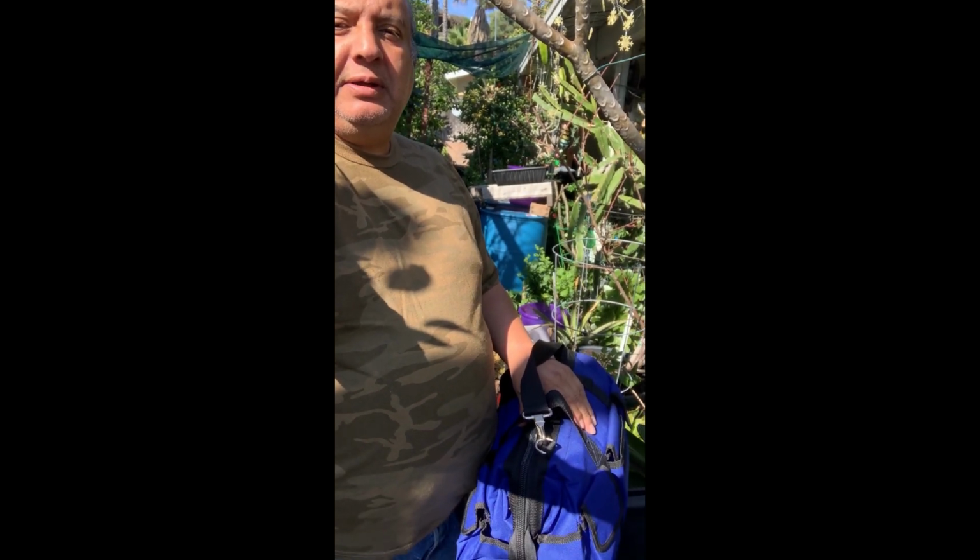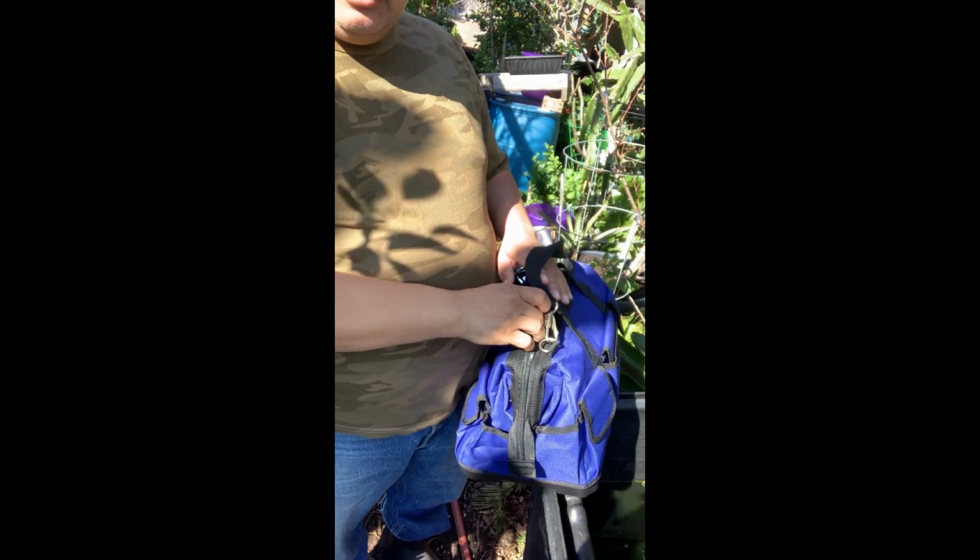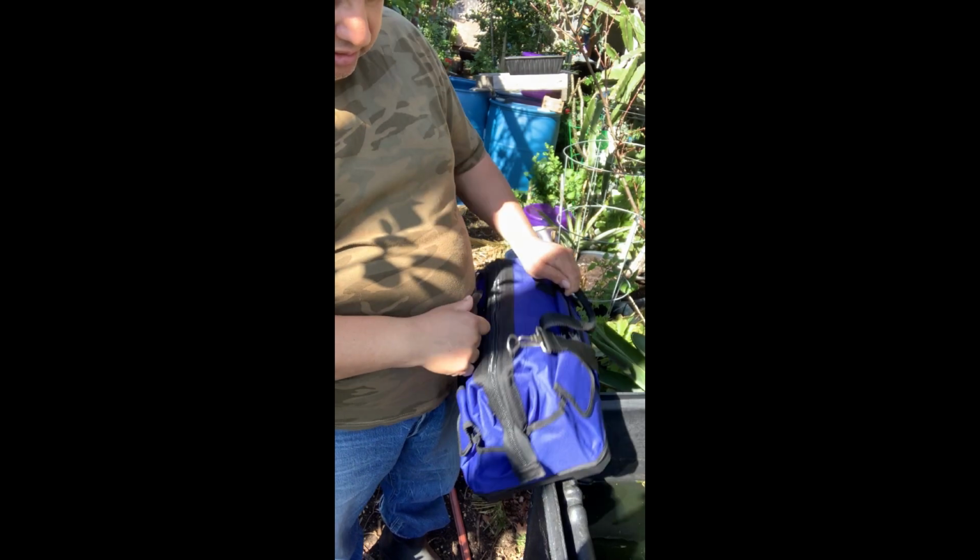Hey, welcome to the Blue Garden here. Alright, today we're going to get the bag of tricks here, and we're going to analyze our compost and put it under the microscope along with the soil. We're going to take soil samples from certain fruit trees and see what's living in the soil. So I got my bag of tricks here, and I got a new tripod.